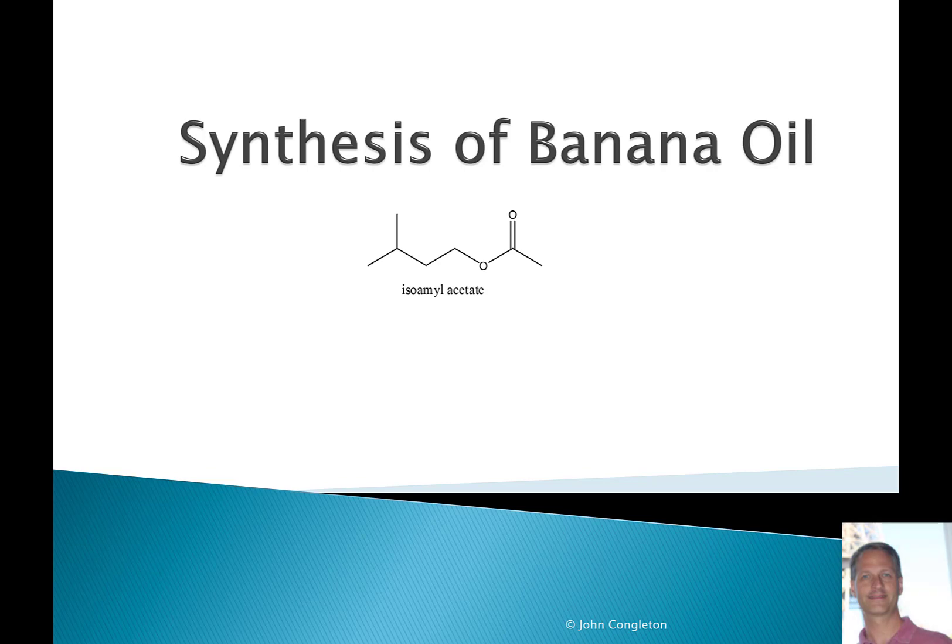In this experiment we're going to be taking a look at the synthesis of esters, specifically isoamyl or isopentyl acetate, also known as banana oil.